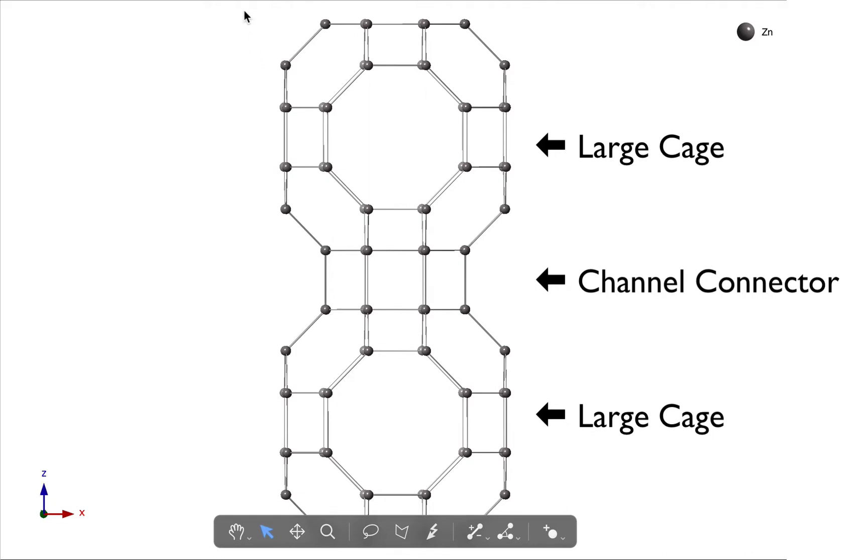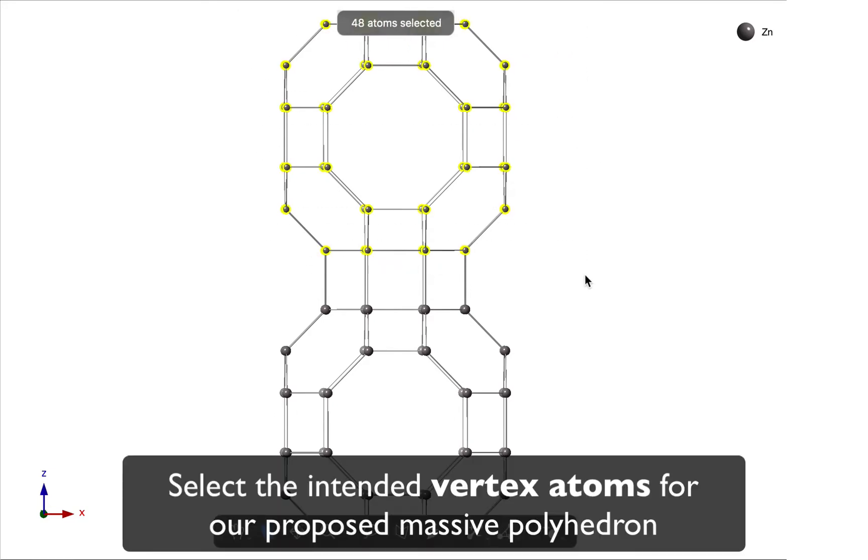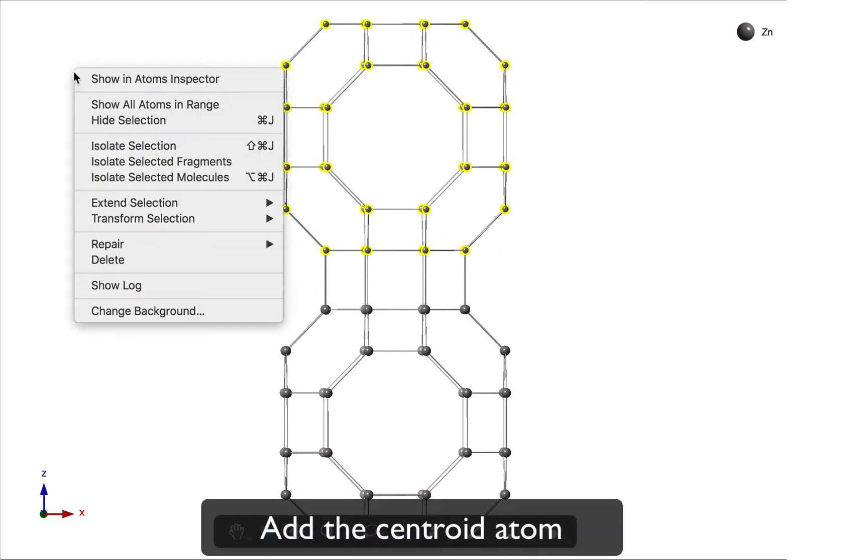I'm going to select the upper unit. Again, I'm going to click and drag with the arrow tool, and I've got 48 atoms. These are the intended vertices of the polyhedron that I want to show. To add a dummy atom in the center, it's very easy. We simply right-click.